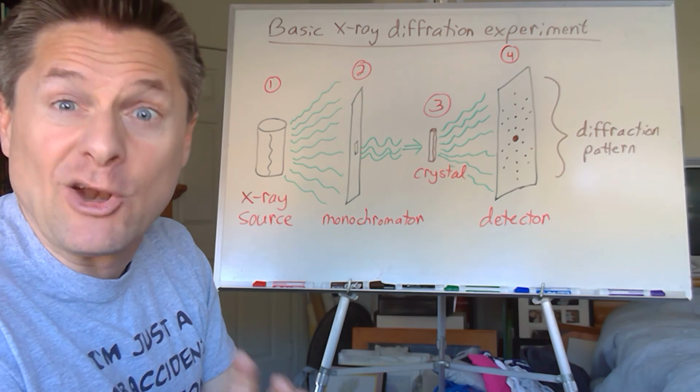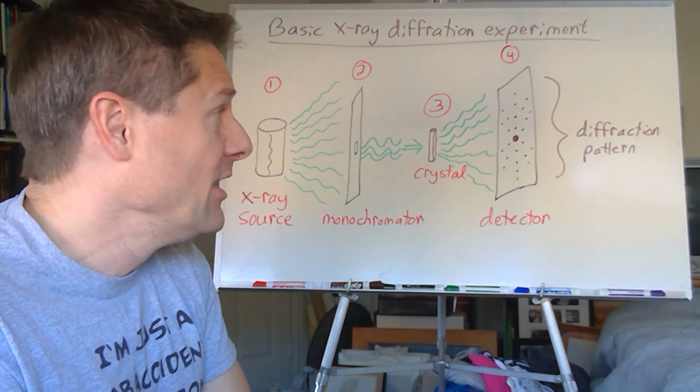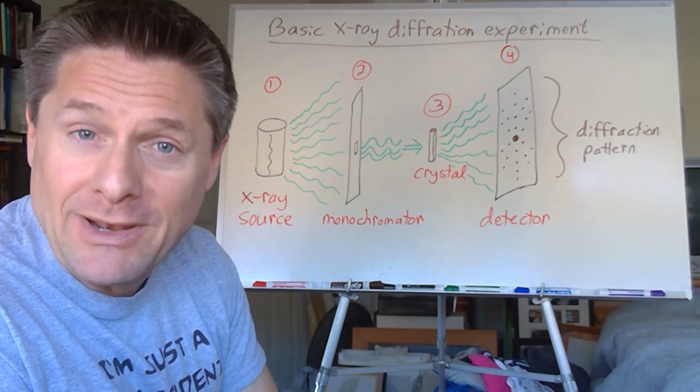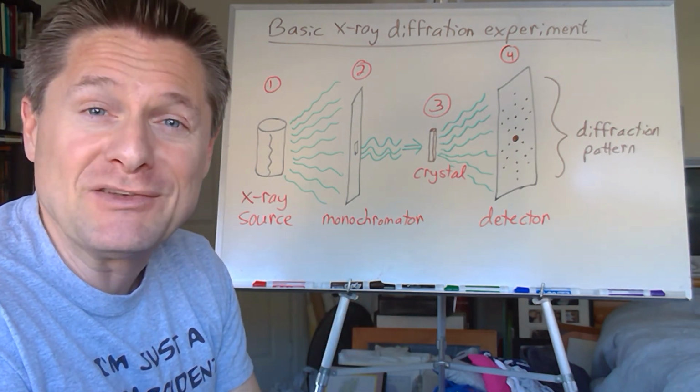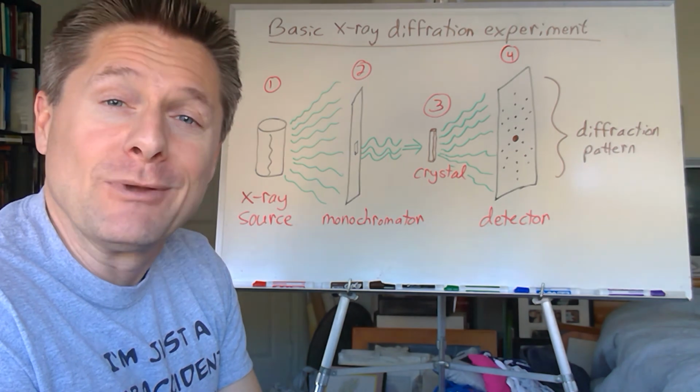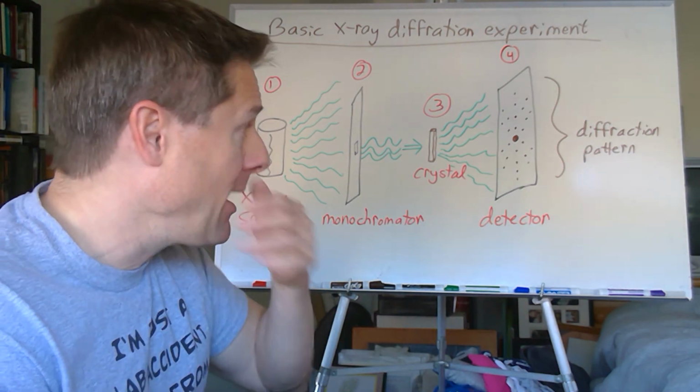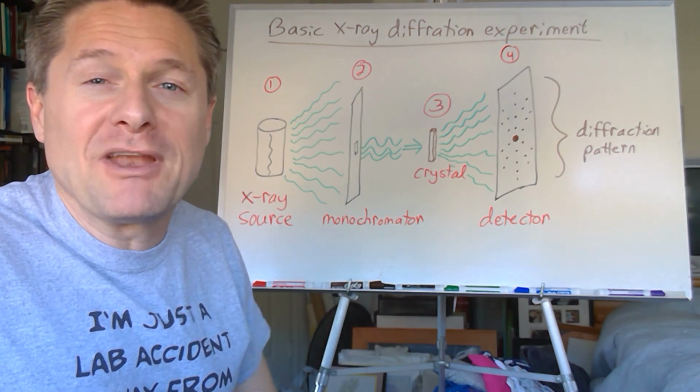So again, I didn't go into great detail on it. If you're more into physics and whatnot, and this really interests you, hey, dig into it. I just gave you a brief little glimpse into it. And again, all we really need is the radius of those atoms for what we want to do as chemists. All right, so that's a little introduction to X-ray diffraction.